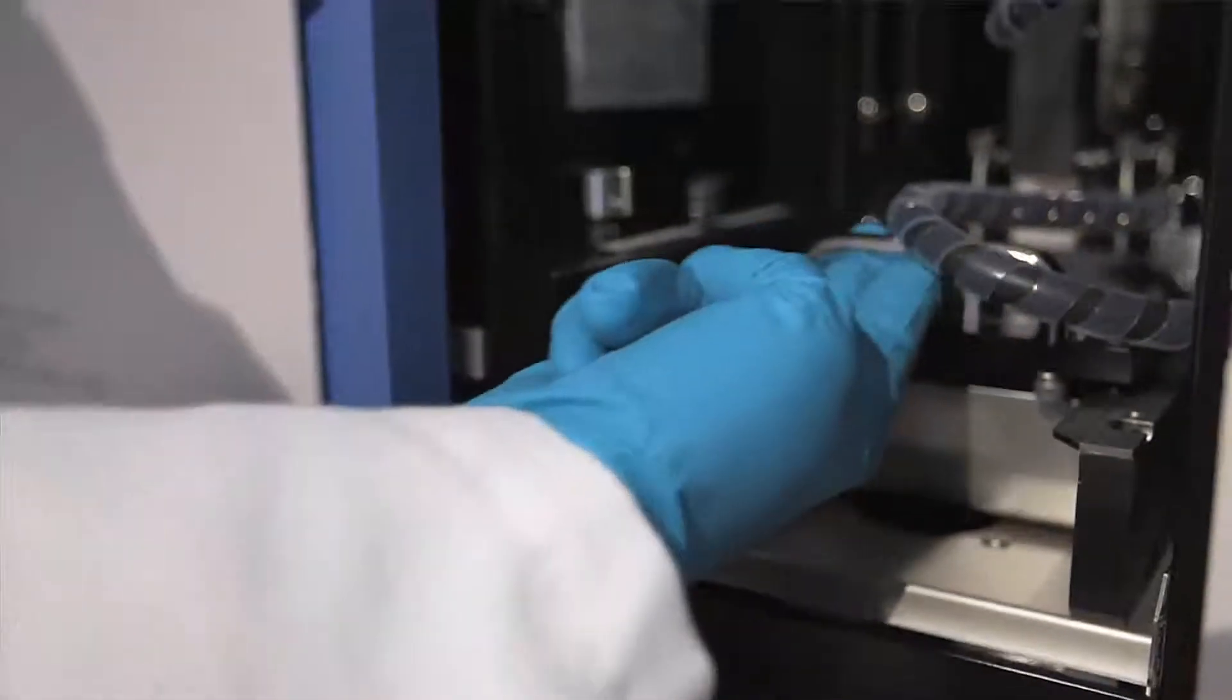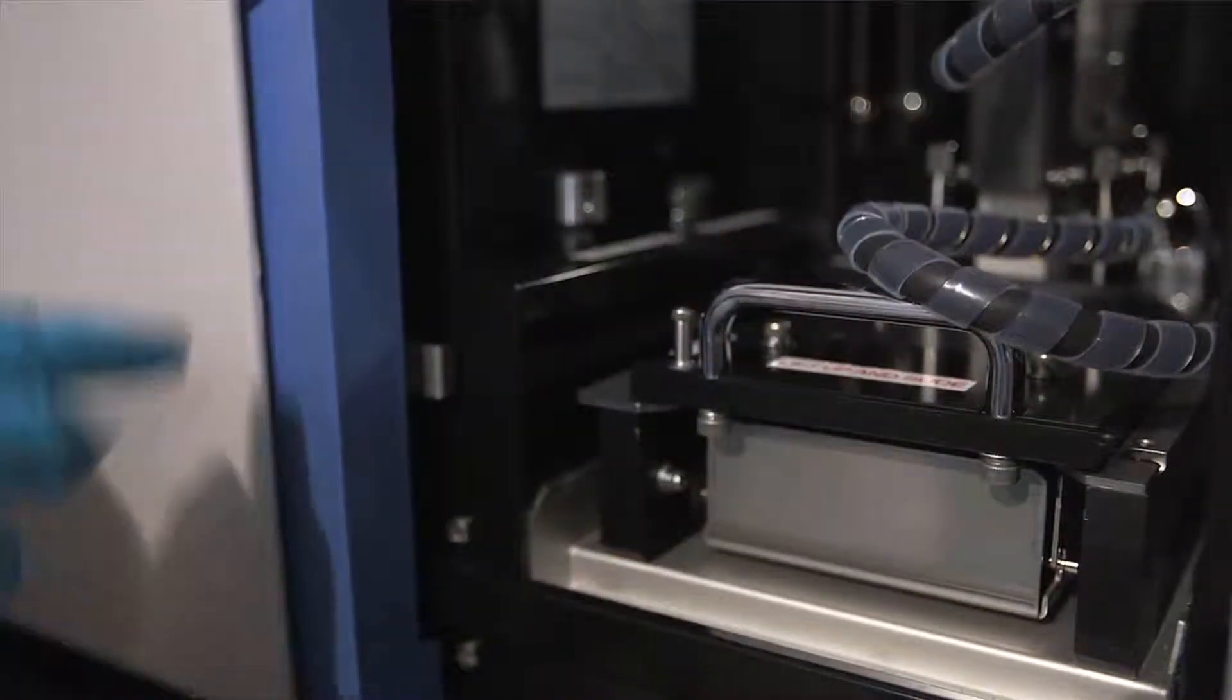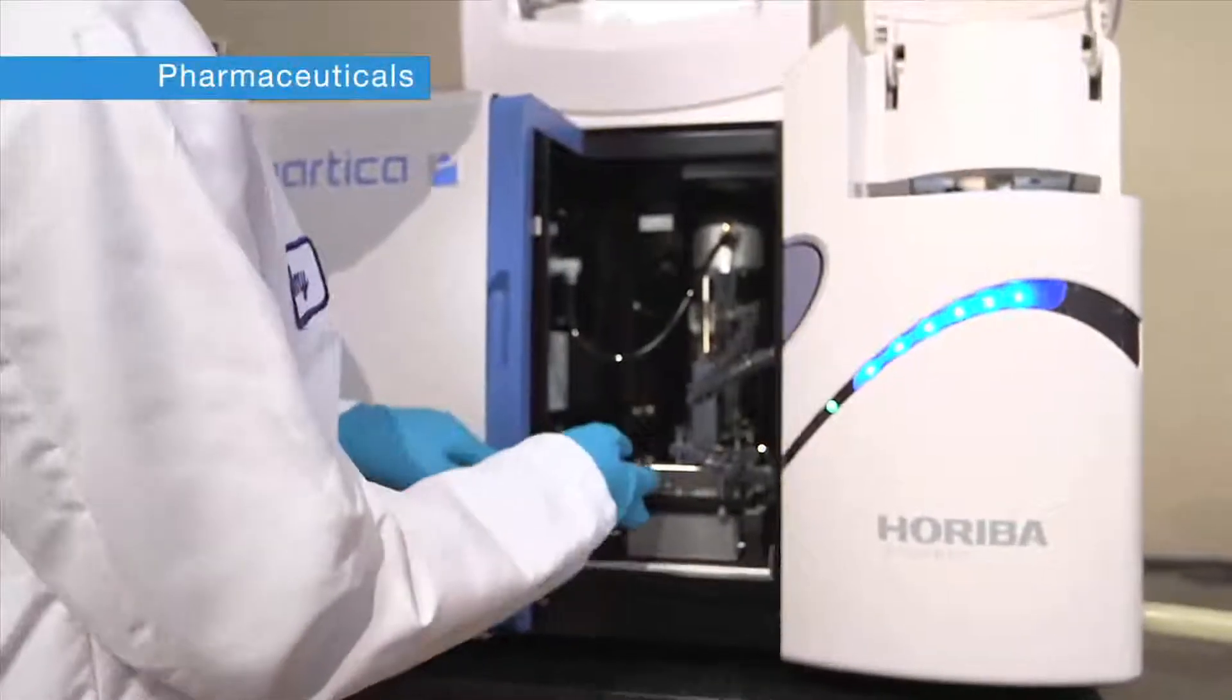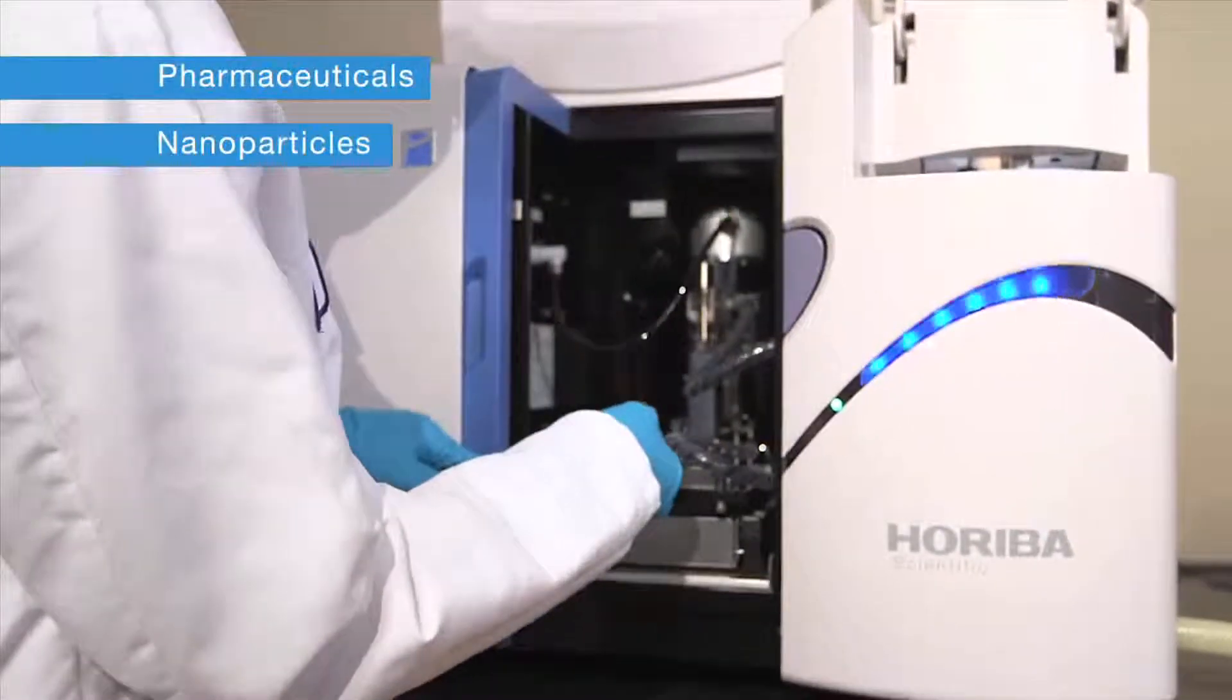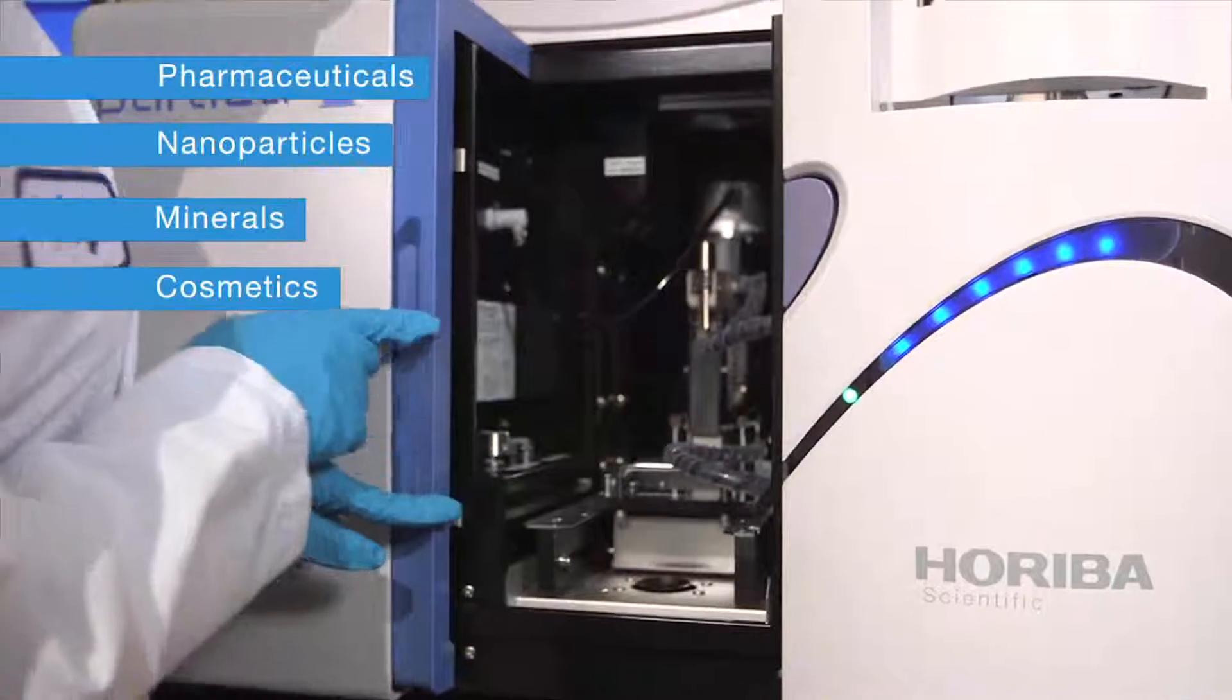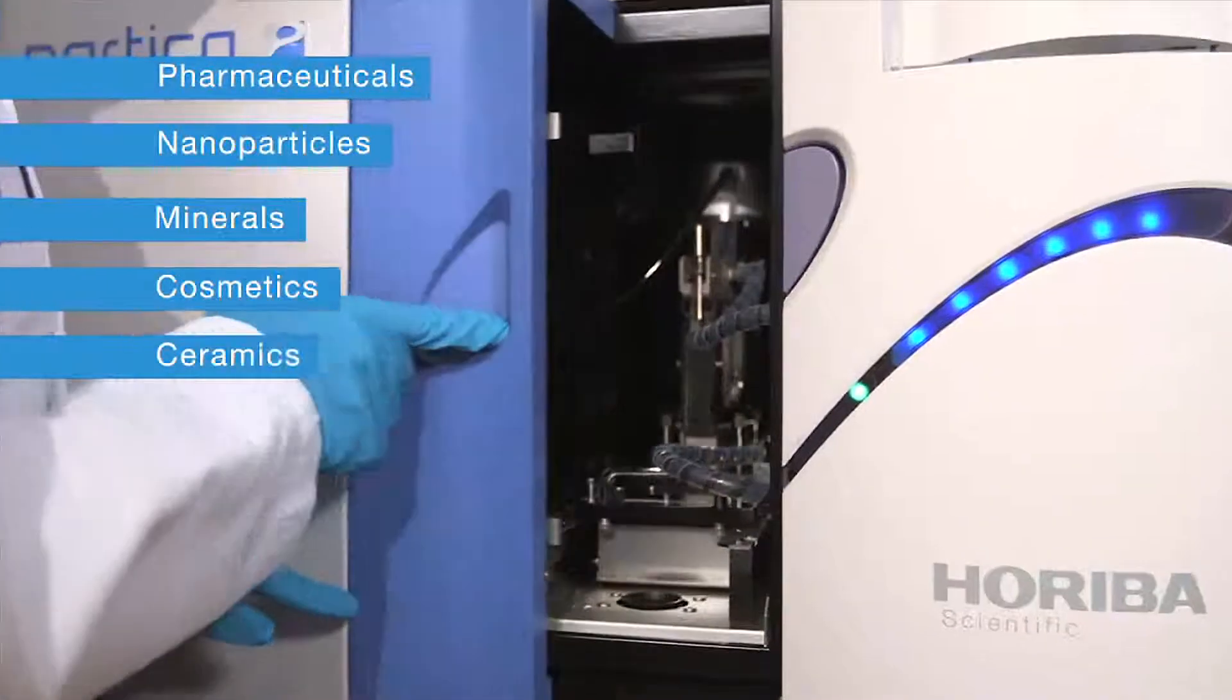Precision particle size measurements can be made for the widest range of applications including pharmaceuticals, nanoparticles, minerals, cosmetics, ceramics, pigments, battery materials, and food products.